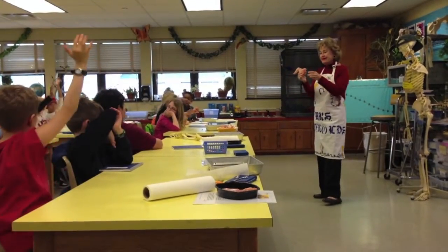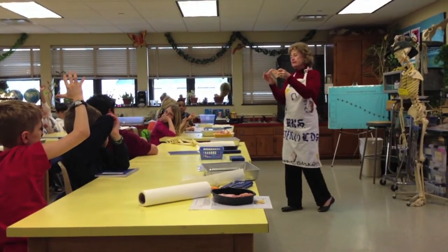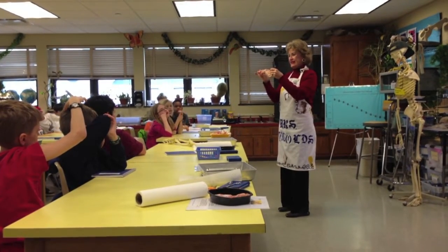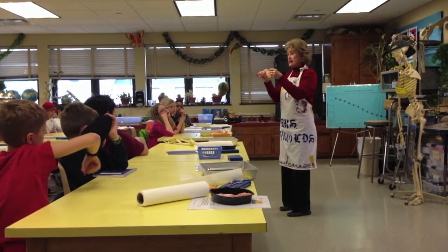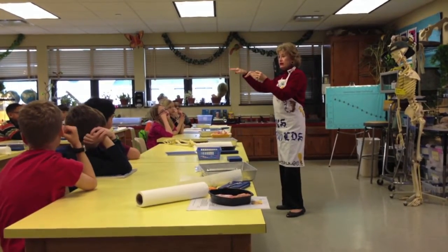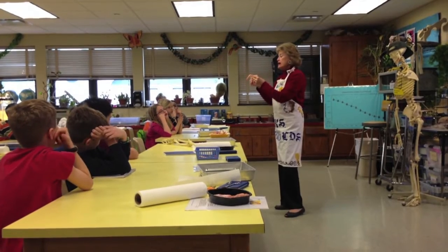Third graders are currently learning about the human body in their classroom, so to complement this study, they dissected chicken wings in Science Lab. Since several structural elements found in a chicken wing are also found in the human arm, Mrs. Reynolds began this lab by demonstrating these similarities.